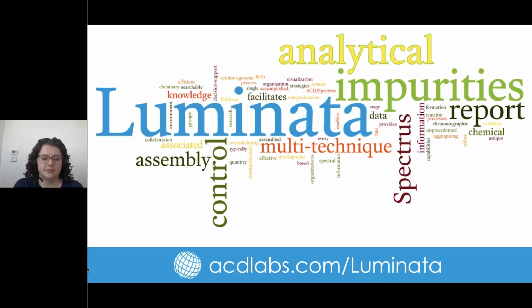For folks that are intending to predict the likelihood of a particular degradant appearing, we do integrate with the LASA platform. We've done that for a variety of customers, so you can bring in your predicted degradants. I'm not sure, frankly speaking, how and whether there is tunability of those prediction modules from LASA to predict a set of structures for a specific time point. I know they have condition-specific prediction, but I'm not sure about time, to be frank.